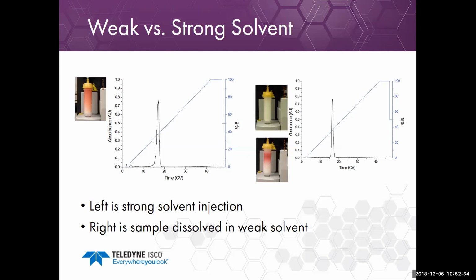In order to run the HPLC with ethyl acetate and hexane for a compound that elutes in 50%, you can buy a silica prep column, and you can run hexane ethyl acetate on silica prep. There's also a technique called non-aqueous reverse phase that is useful for very non-polar solvents, but such compounds won't elute in 50% ethyl acetate and hexane.